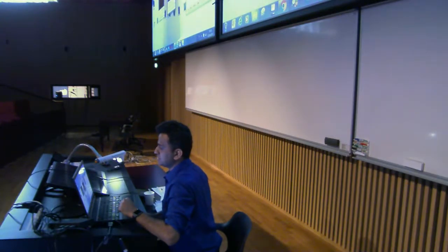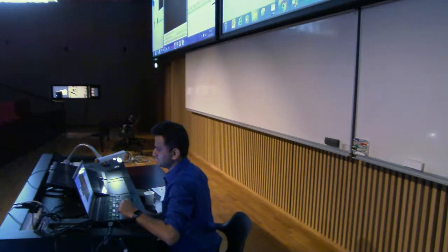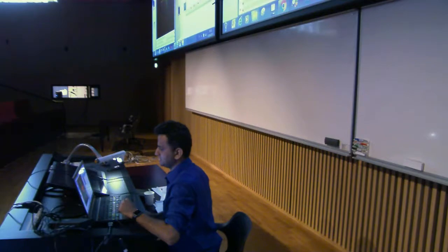Yeah, so just go here, and let's say I'm interested in knowing what happened to this particular region. So you just go here, I draw this region, and from the beginning to end I can actually map this. And how do we do this?